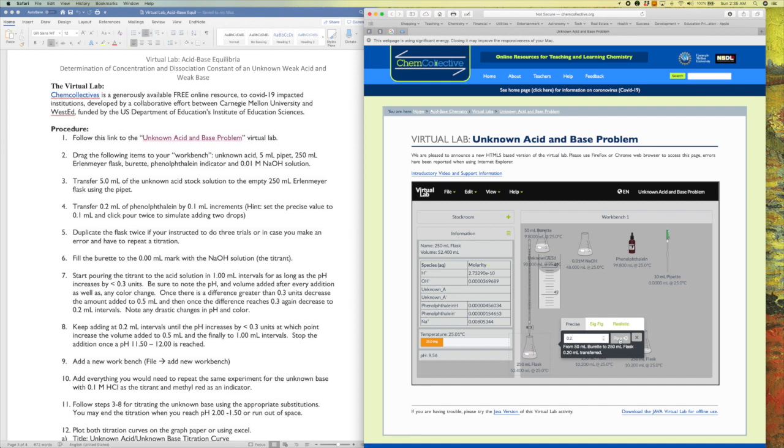So I'm going to click again, and so that was again like 0.3, right? So the jumps are not that large now. I'm going to do this again. So that was about 0.2, right? And another 0.2. So now the increments are getting fairly small.